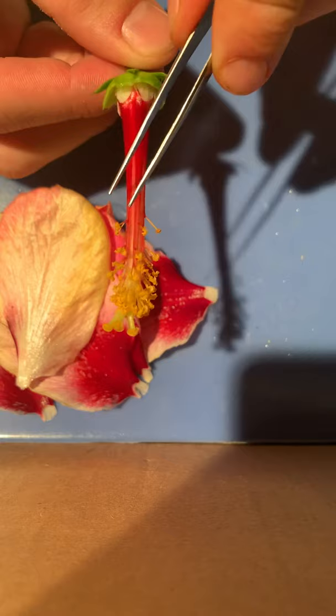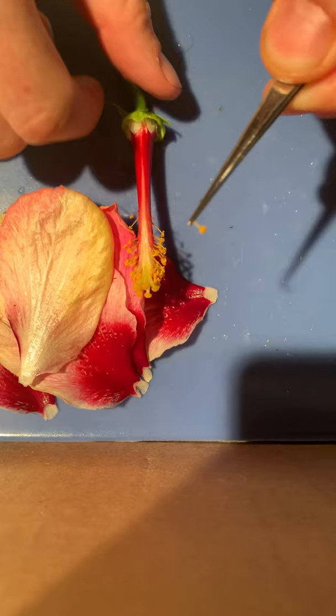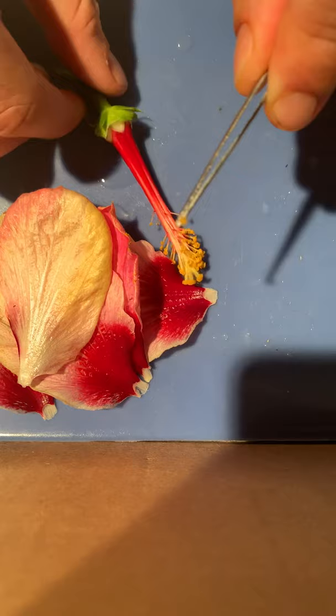I will pull one off right now and show the camera. So this is composed of two different portions: there's the stem-like feature right here which is called the filament, and then the tip which is the anther, which has the pollen and sperm on it to fertilize the ovules inside.